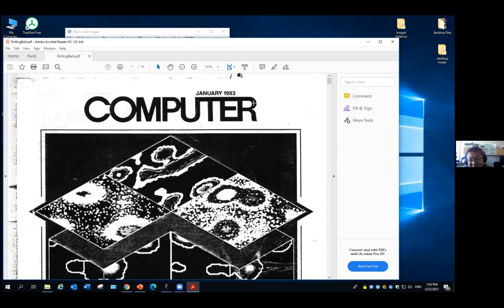More than 50% of the time you apply this to your image, you can get a pretty nice result. This is the function you're going to use a lot, I assume. But again, you have to try it on your image to see how it works.